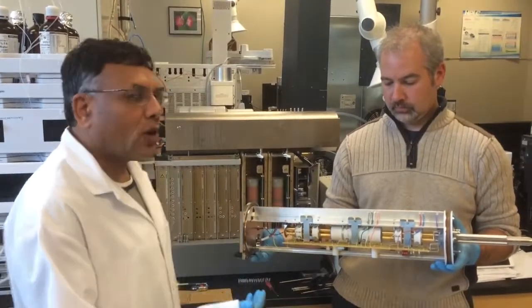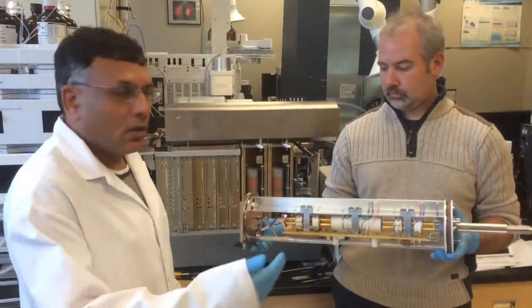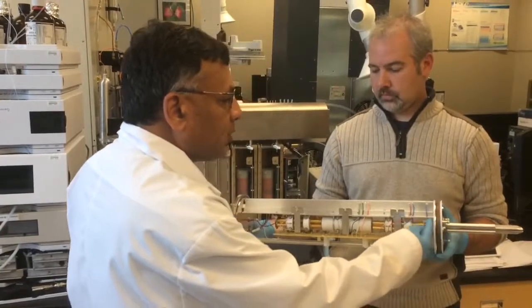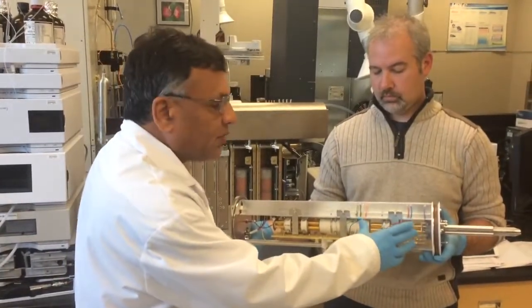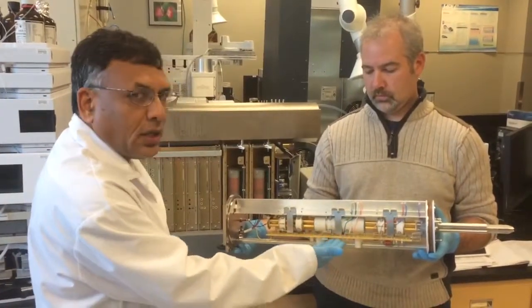This is the triple quadrupole with trapping capability. The ions move from here inside the mass spectrometer. They get aligned in stage one, which is called quadrupole one, then they get fragmented in the second stage.